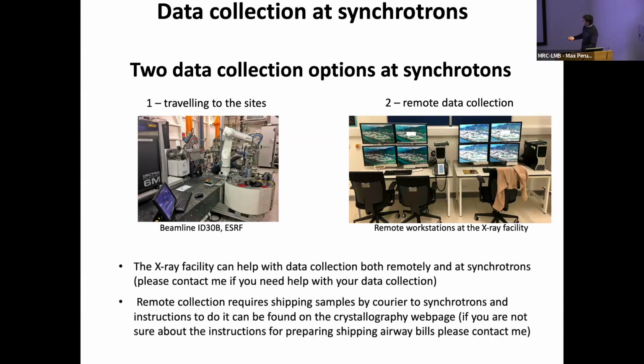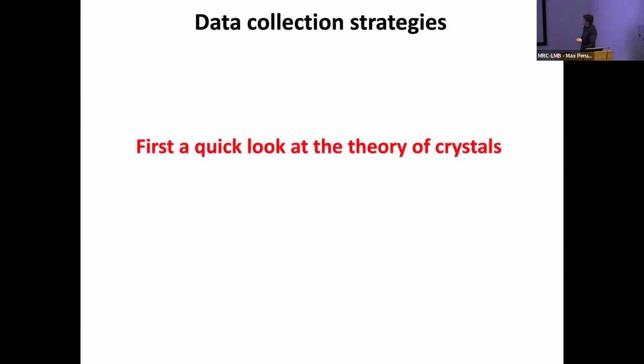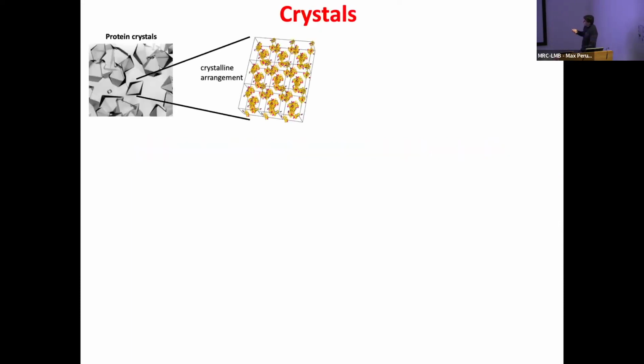Okay, we just discussed that. So, data collection strategies. Very quickly, let's go through a bit of theory so we will understand the collection strategies better. So exactly what's a crystal?